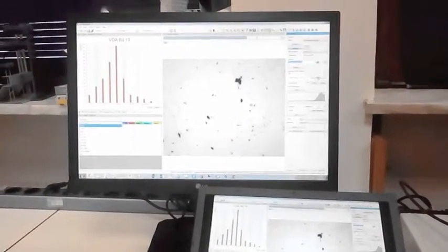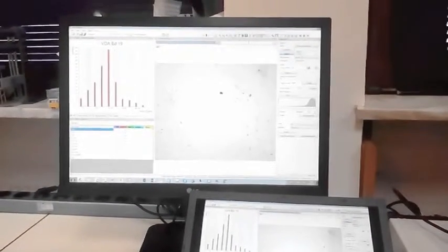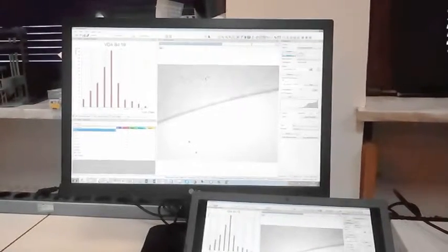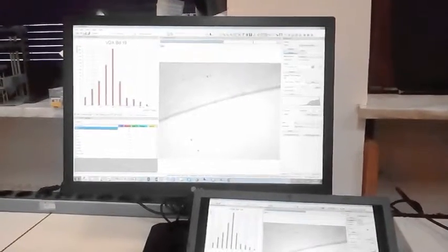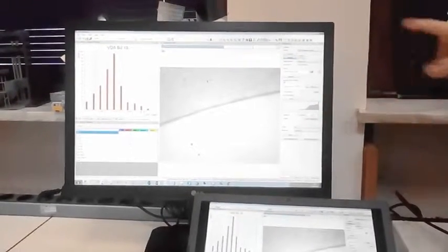So we start with new, and then we are looking for one edge. So it's the first click. You can see here that it counts your numbers. So that's 1 out of 3. We're basically creating a triangulation, if you like, of the circumference of the filter paper.